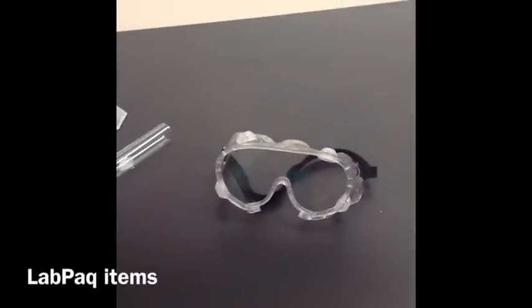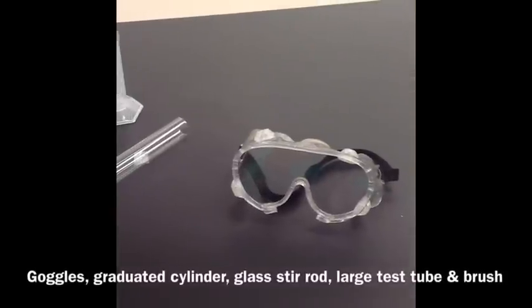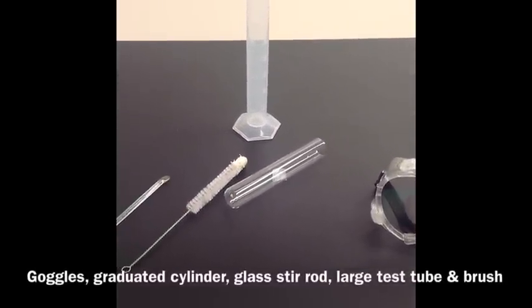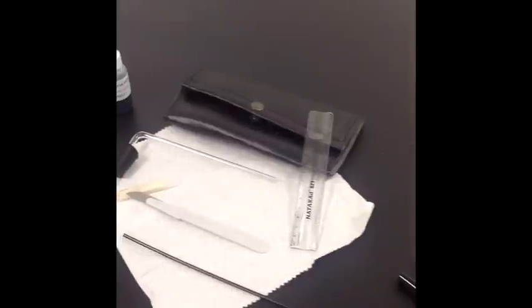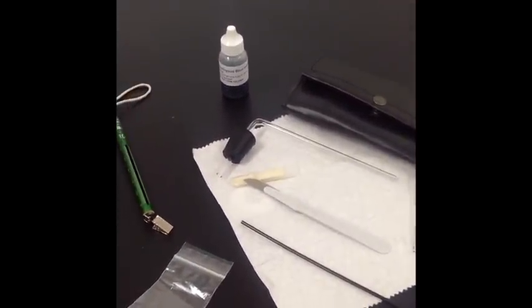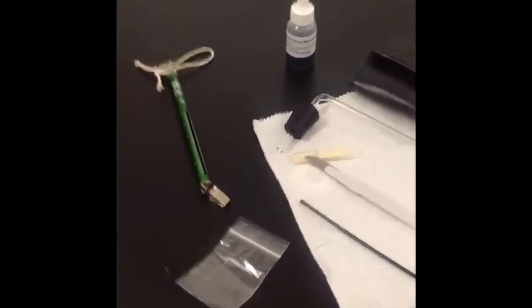Now for the items that you'll need from your lab pack kit: grab your safety goggles, your graduated cylinder, the large test tube, test tube brush, and the glass stir rod. From the dissection kit you'll need the plastic ruler and the scalpel. Look for the disposable straw. Last, you'll need the respirometer, which is a piece of bent glass tubing inserted through a rubber stopper.